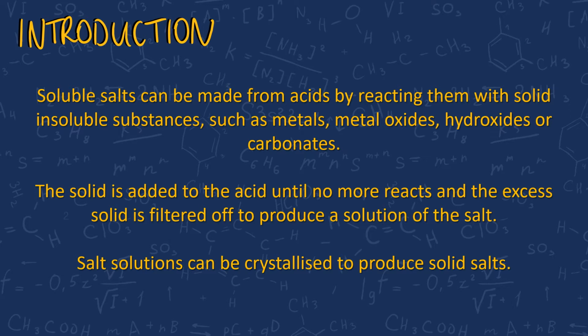So for the second sentence, it says that the excess solid is filtered off. We need to filter off that excess solid, otherwise we are not going to have a pure, clean sample of the salt, because there are going to be little bits of solid in there, and we don't want that.